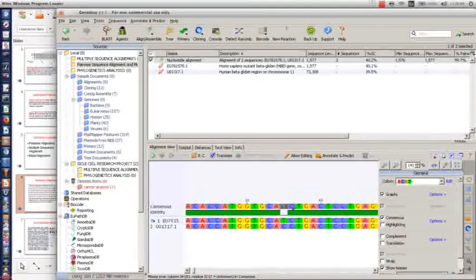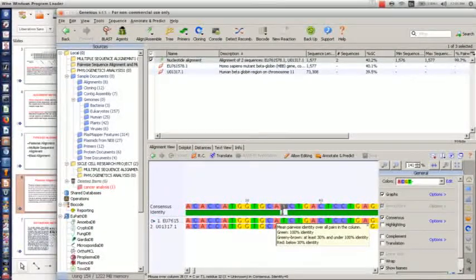As you can see, the consensus sequence is giving us Y instead of an aligned consensus nucleotide base determined from the two sequences. But this one is telling us that it is Y here, which means it is giving you a probability that it is either C or T, a probability of the nucleotide that might exist here. And then we have the graph, which is telling us there's a gap here, so there's an issue here that you need to study.